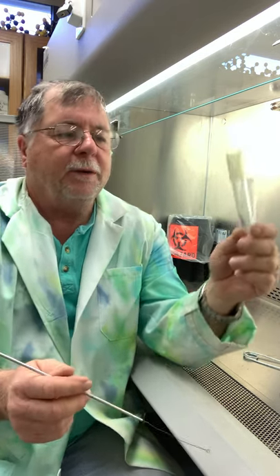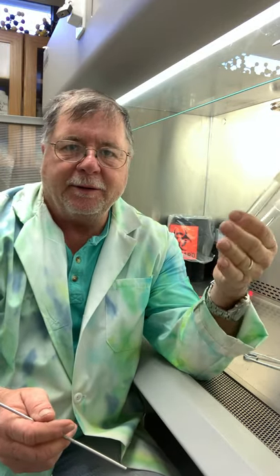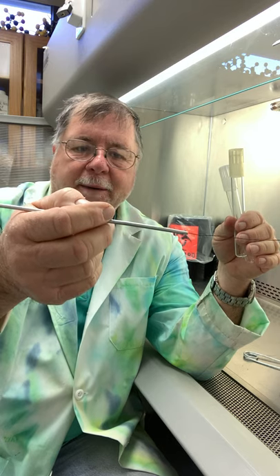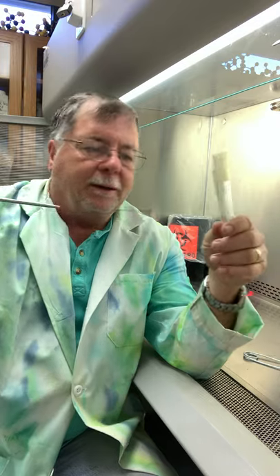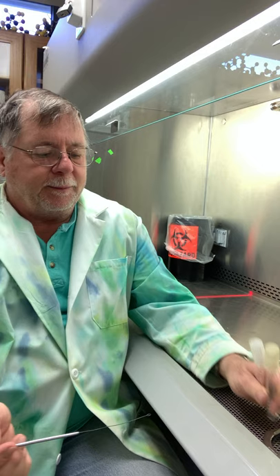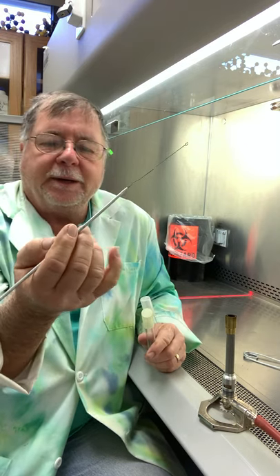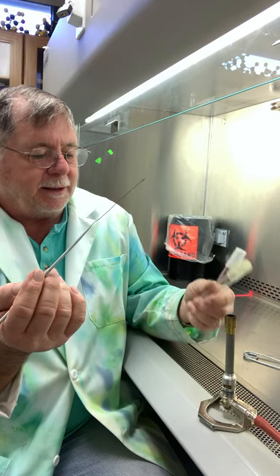All right. So we're going to take these and hold them both in one hand, the opposite of your most dexterous hand. The loop is in the other hand, your dominant hand, and you hold it like an ink pen. Okay, so we'll flame it first. We'll have to pretend that there's a flame here. Okay, we flame it, get it all flamed like that, and then we come out and it's sterile. And then we have to flame this guy.